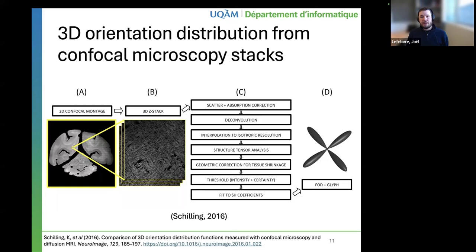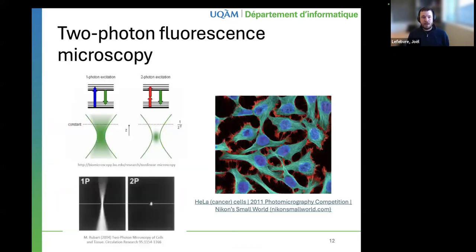One disadvantage of confocal microscopy is that the volume where the fluorescence can originate is kind of big. And also, because we use pinholes, we limit the amount of light that can come to the detector. So we have a lower SNR. We have more noise in our measurement.